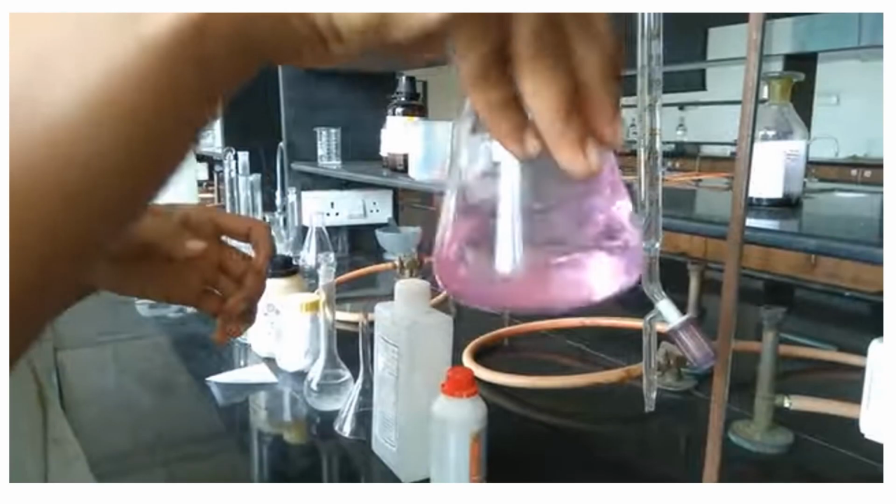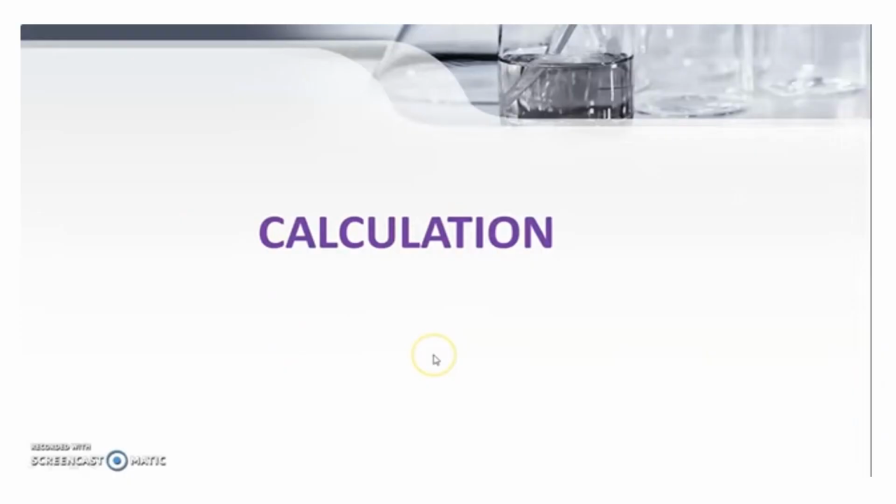As I mentioned before, during titration the end point can be obtained when the pink color is observed. You have to stop the titration and record the burette reading, which is the volume of sodium hydroxide consumed for the titration to reach the end point. This is the result, or the observation, you get.